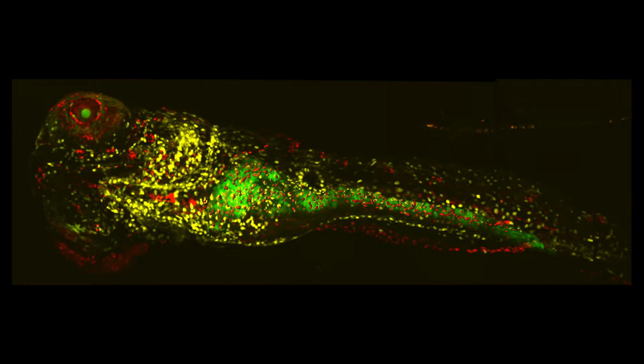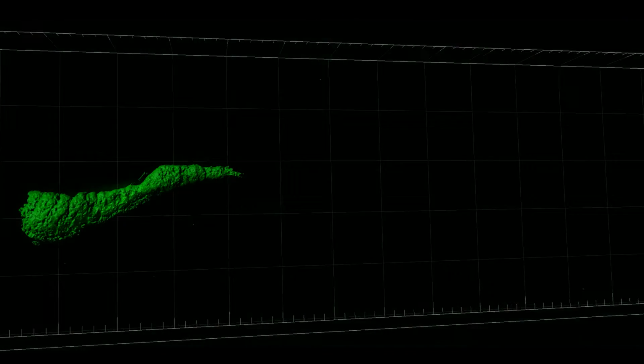But I can go even further. So with my background and my experience, we can zoom in down to a single particle and see what single particles or single proteins are doing within the live zebrafish. What we're currently pursuing in Joan's lab is to take some of the findings that we've made in recent years and look at how particular processes occur within zebrafish development, particularly looking at the intestine.